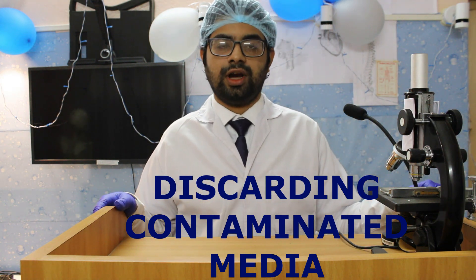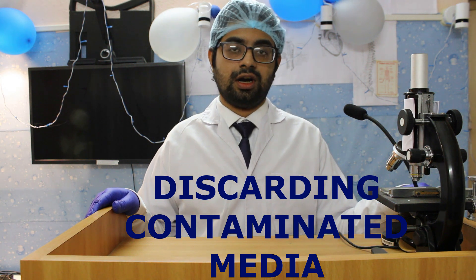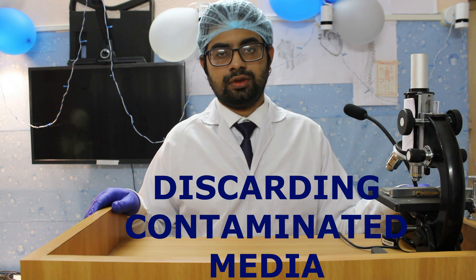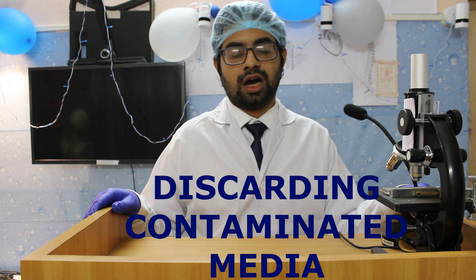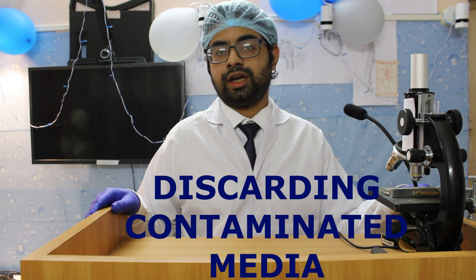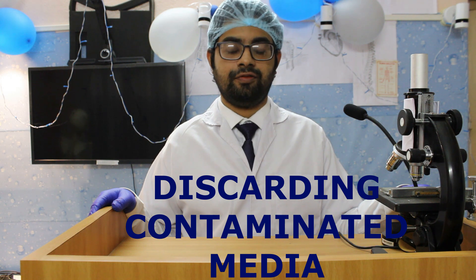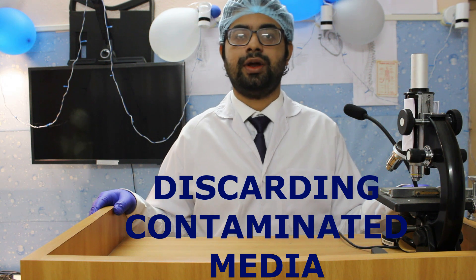Hello, welcome to Biothrills. In this video I am going to show how to discard contaminated media in flasks or in petri plates in an autoclave machine. Discarding is important because to start a new experiment or to refresh an experiment we cannot use contaminated media. For that we need fresh media, and therefore discarding is important for the old media in flasks or in petri dishes.